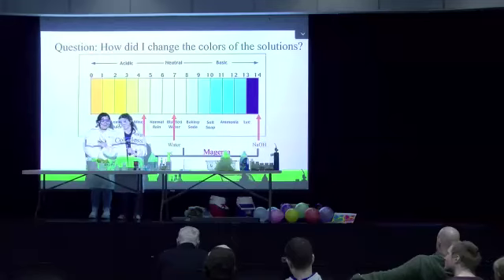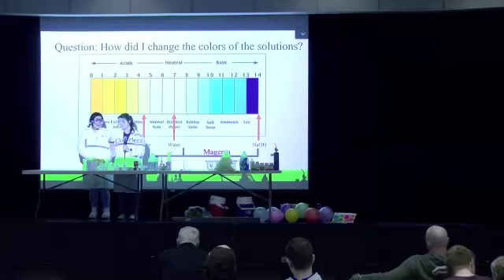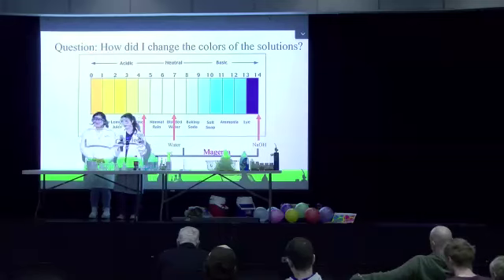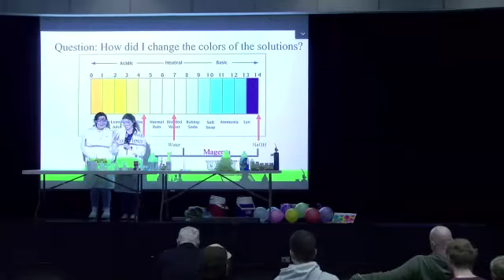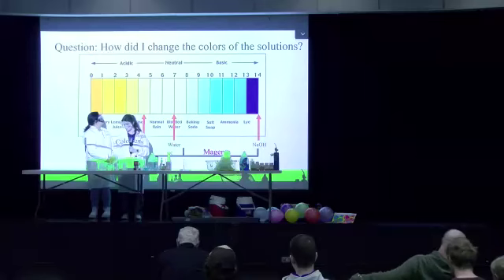This beaker actually had nothing in it, so we weren't lying to you about that one. But when we put it back in here, this one had acetic acid in it, which reversed the color change and made it clear again. Does anybody know what acetic acid is in everyday cooking? It's actually vinegar. So this last beaker just had normal vinegar in it. So this was just one big chemical reaction that changed color and then changed back because the reaction got reversed back to the clear color. So yeah, pretty cool.